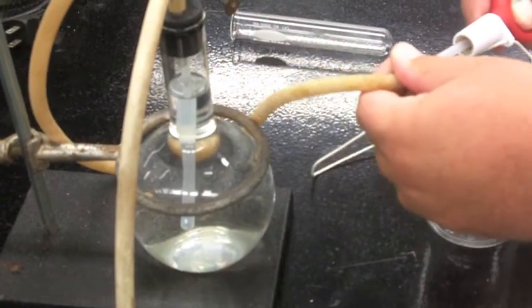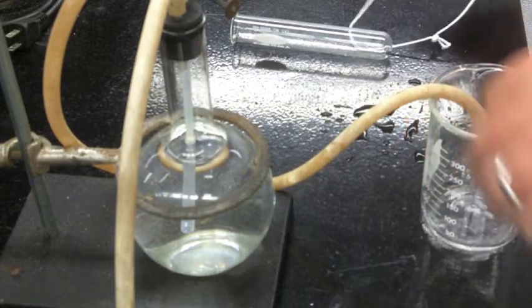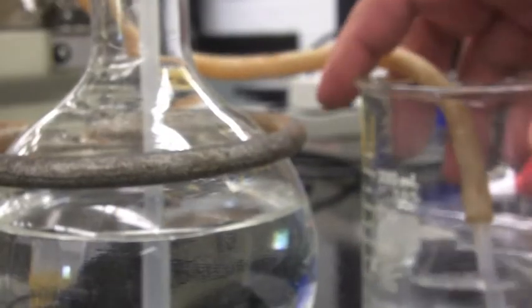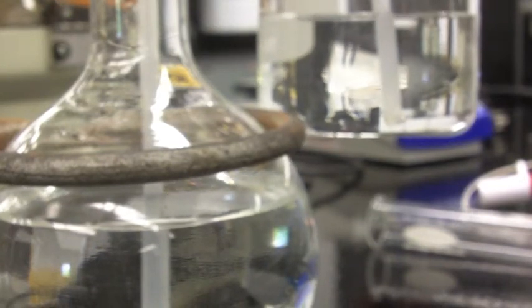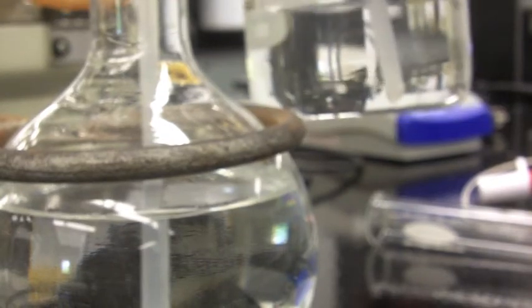Now the first thing you need to do is get a siphon going. You can either push it or pull it, but you need to get a siphon going from the Florence flask into a beaker. Now we want to make sure that the water pressure doesn't add any additional pressure. If the siphon's active, you should see the water level go up and down. You can see how it goes up and down here when we move it.